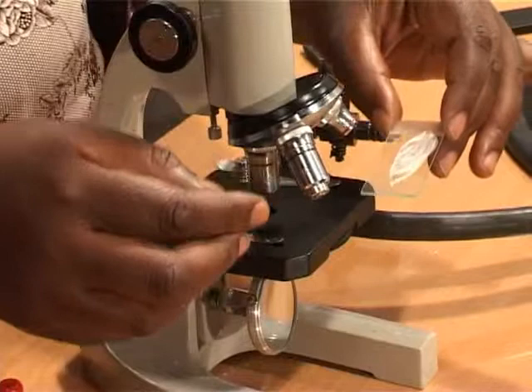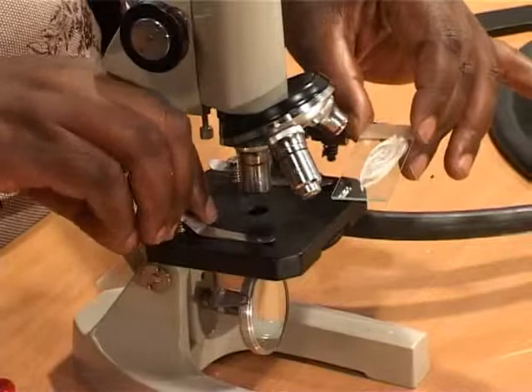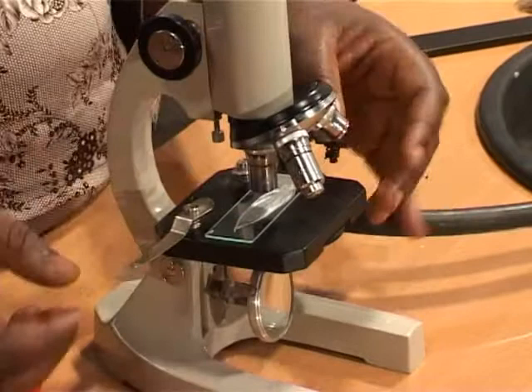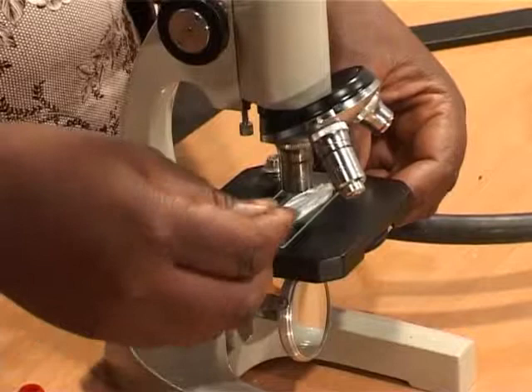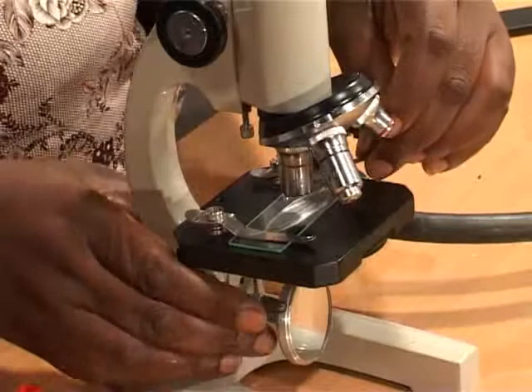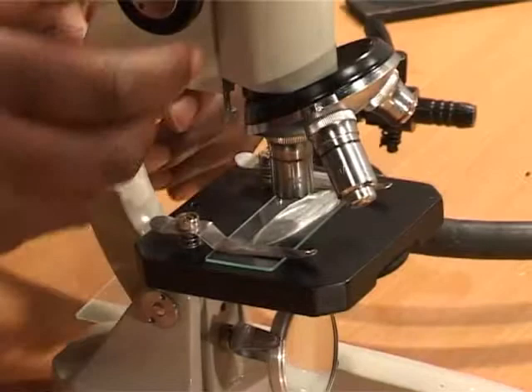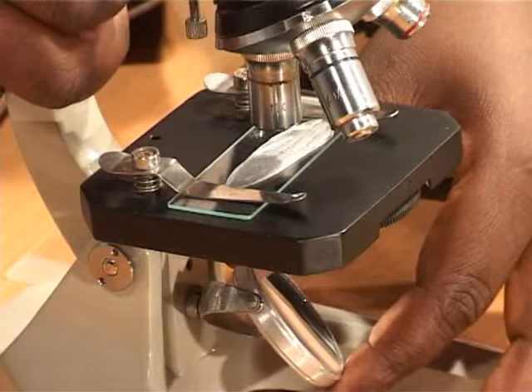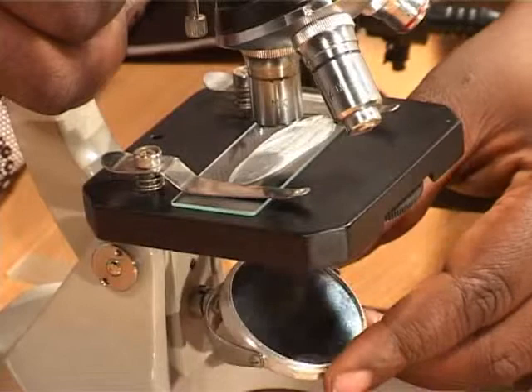You are going to put your specimen on a stage, okay? So we are going to remove the clips, okay, microscope clips, and put our specimen there. We have to move the clips so that they hold the specimen like that. Okay? Now the next thing, we have to put the mirror properly so that light is reflected through the hole on the microscope. So you have to put it properly like that. Okay.